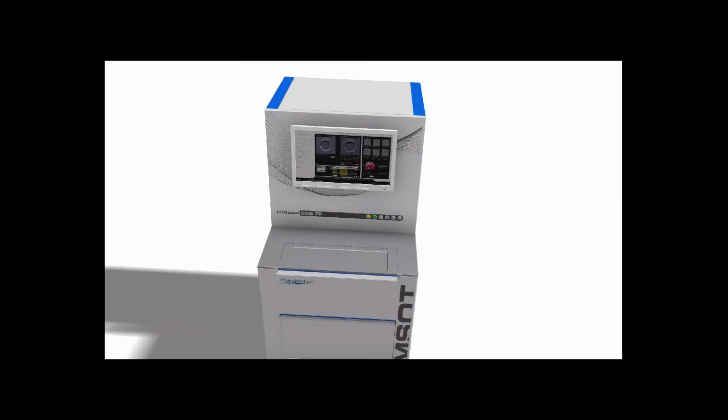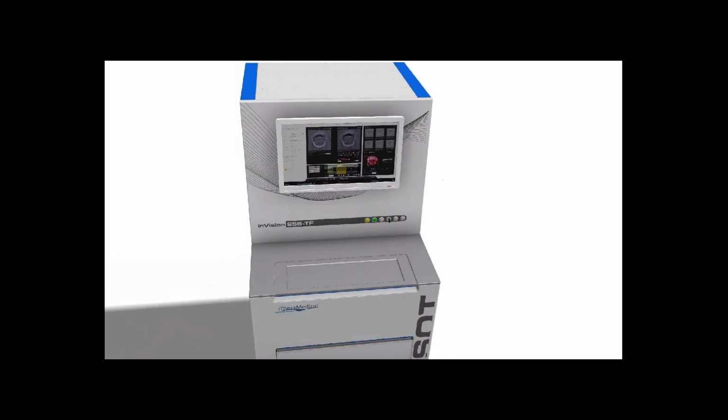This video shows the preclinical MSOT imaging device. The unit itself is about 2 meters tall, 1 meter wide, and 1 meter deep. What you first see in this video is the screen, which will show you in real time both the single wavelength image that's being acquired at the moment, but also a multispectral preview in real time that shows you the distribution of molecular probes.